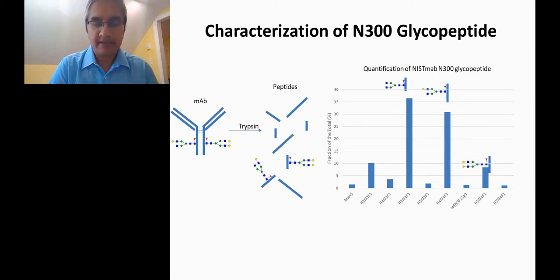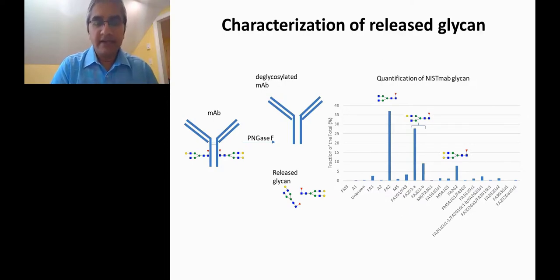Agilent's MassHunter software is pretty good at picking up these glycosylated forms of the glycopeptides and coming up with accurate annotations of the glycan topologies based on the mass signatures. So this represents the glycopeptide layer for the analysis of the glycan signature.